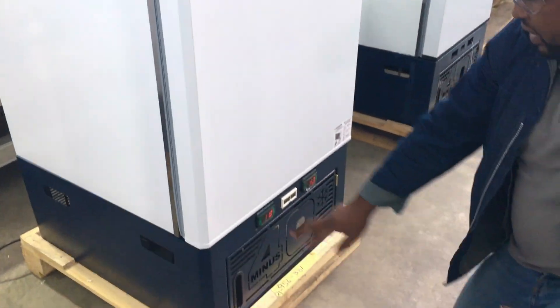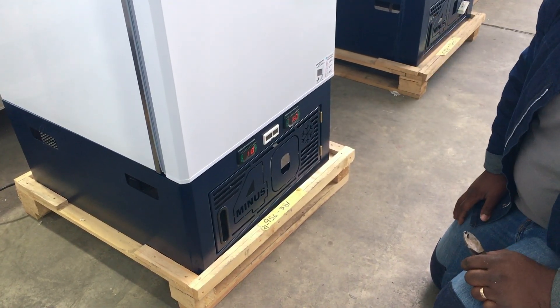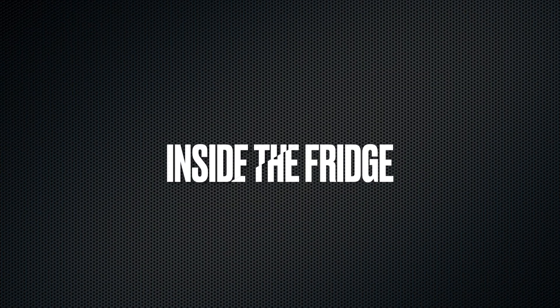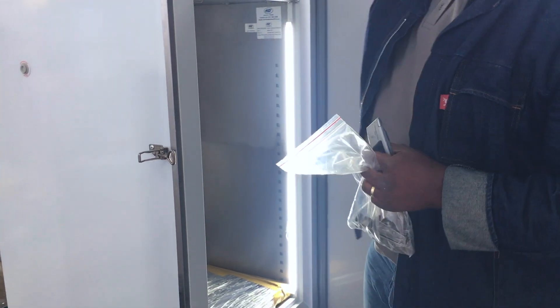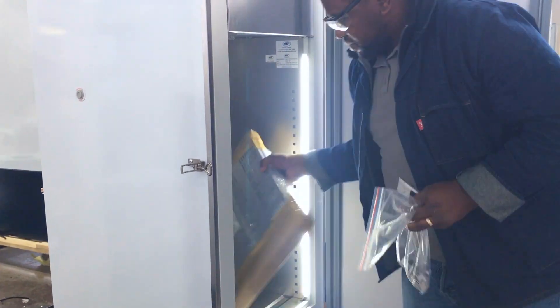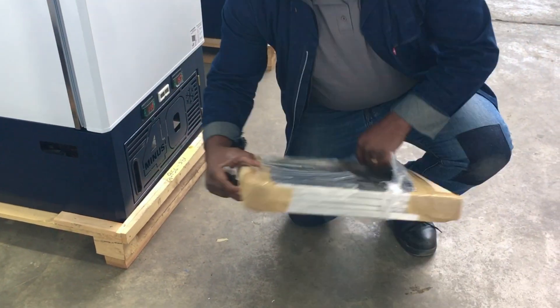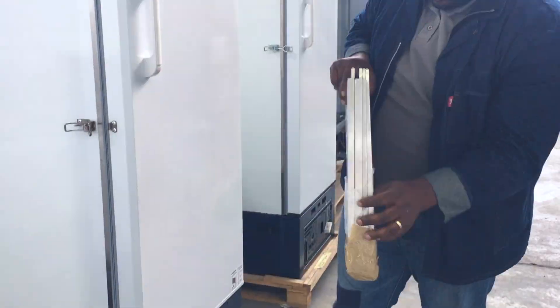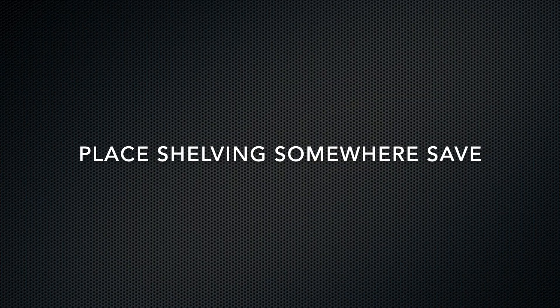As soon as you plug in your fridge, you will be able to see that both controllers are on. Then take the knife again and remove everything inside. Put the warranty certificate aside, get the jacklips and the shelves, and use the knife to remove the shelves from their packaging. Once the shelving is ready, find a safe place to put them.